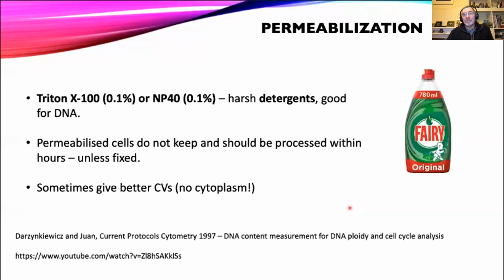But it's a good habit to get into. It doesn't matter how long you fix for, really, anywhere between 15 and 60 minutes or something like that. But keep that fixation time consistent, and remember to wash it off at the end, because it will increase the autofluorescence. If you're just looking at DNA, that probably doesn't matter too much. But if you're looking at weakly expressed markers as well, it can make a big difference.